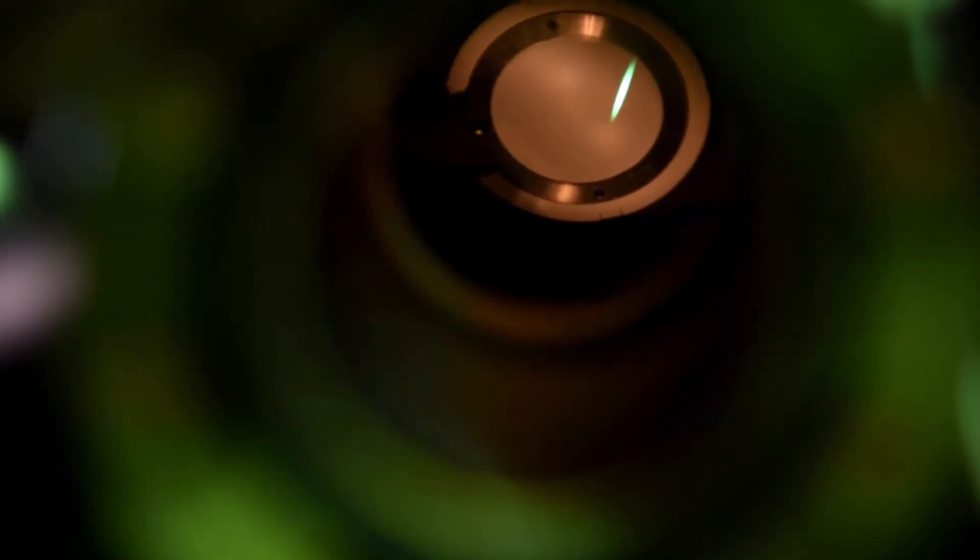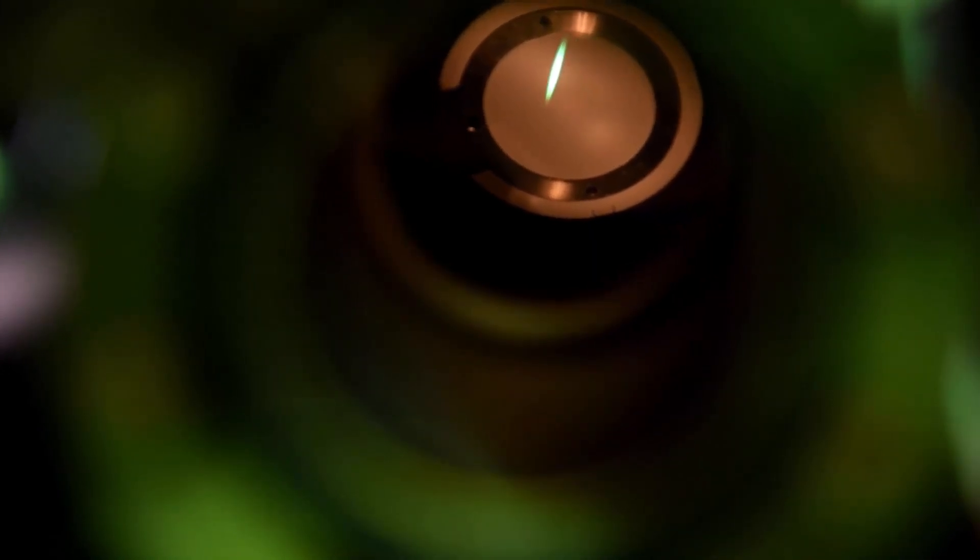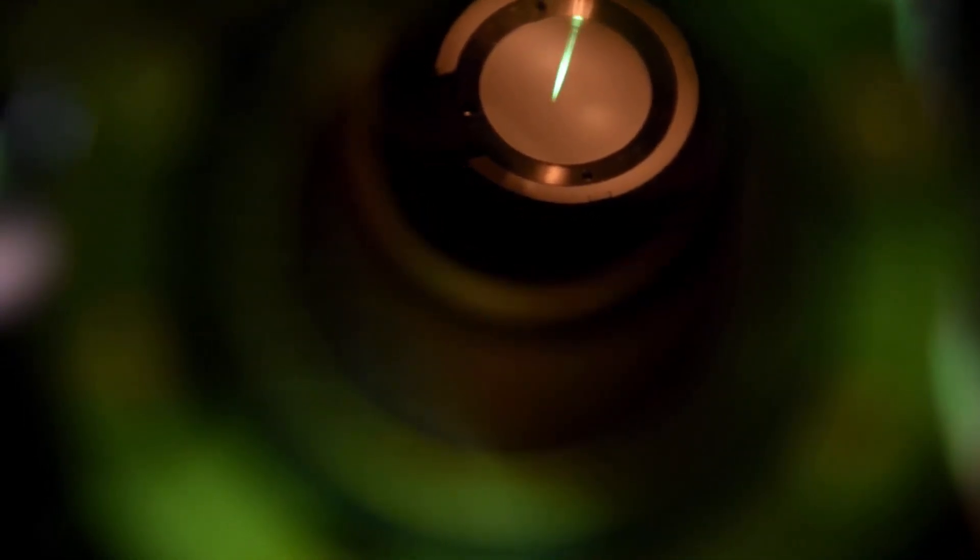Do you want to know what your electron beam sampling area is on your substrate? Have you struggled to properly align your RHEED electron beam? Our beam alignment substrates can help.